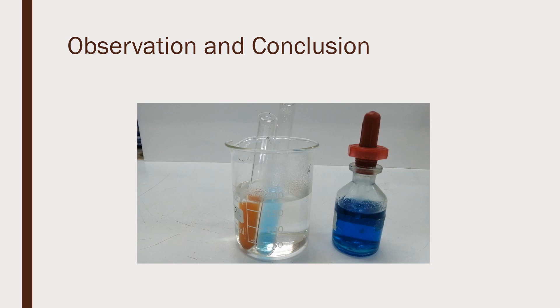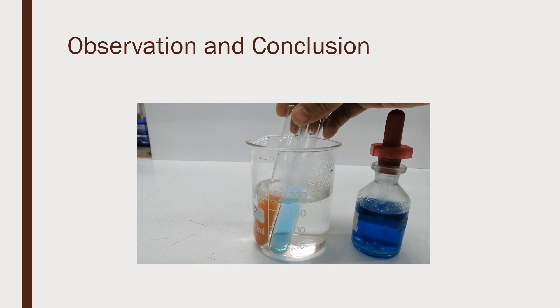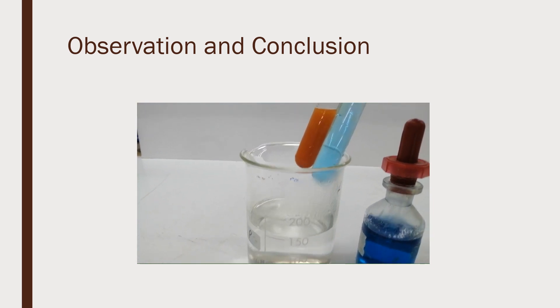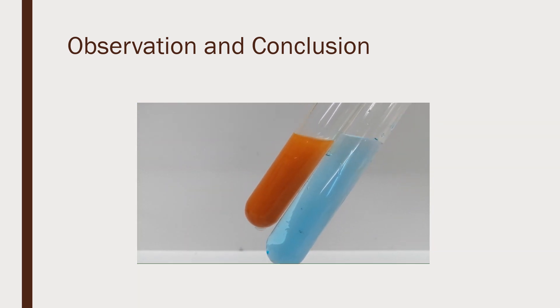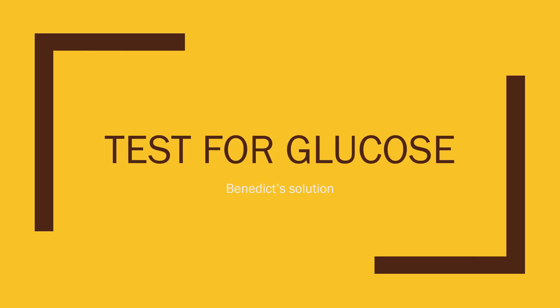We compare now the distilled water and the glucose solution. The distilled water remains blue with no observable color change, while the glucose turns orange. Glucose is present in the glucose solution, while glucose is absent in distilled water. This is the test for glucose.